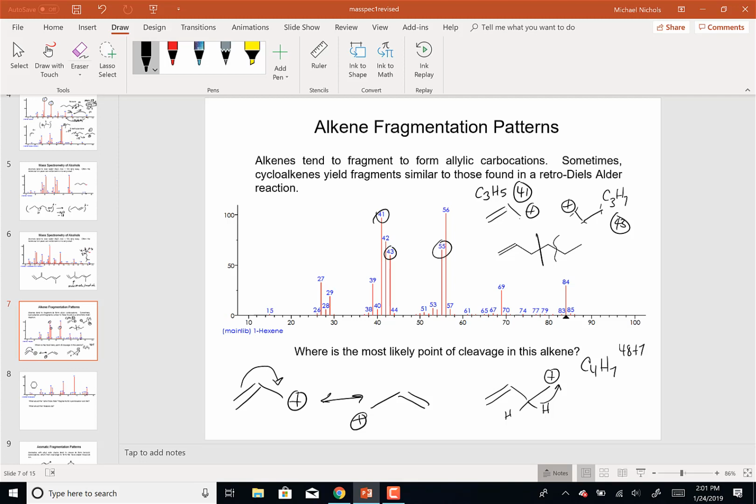So, similar process. The rule for a carbocation rearrangement to occur is you must form a more stable carbocation. So if I slide that hydrogen over, what am I forming? I'm now forming a secondary alkyl.